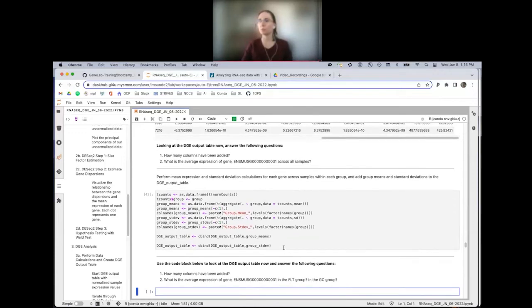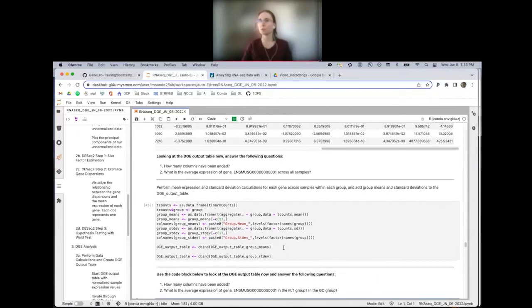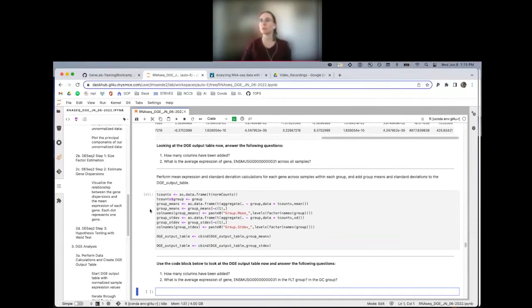So some people's kernels may be still running. Whose kernels are still running? Maybe they still say busy, and make sure if it says busy that you also have an asterisk. Okay, thank you. Anyone else? All right, so multiple people still have their kernels running.